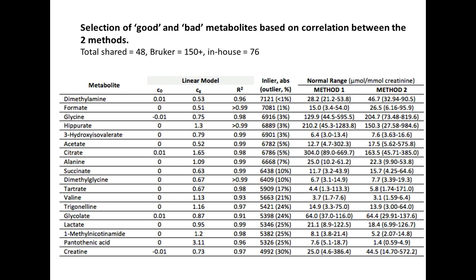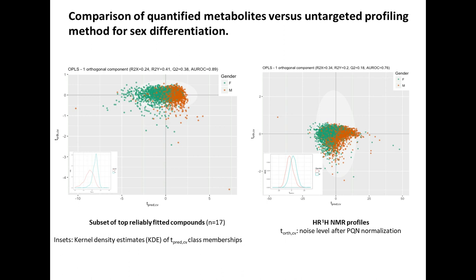So knowing the creatinine is fitting well, we then moved to look at other metabolites, about 200 metabolites in total. For those that overlap with Bruker, which was 48, we found good correlation, mainly within 5%, with a couple of metabolites outside that range, possibly to do with relaxation, and the methods we're using in Imperial don't quite accommodate overlap of peaks. But again, we find good correspondence between the two methods.